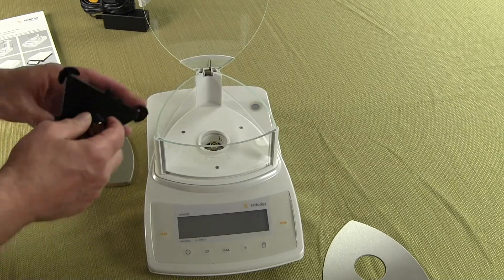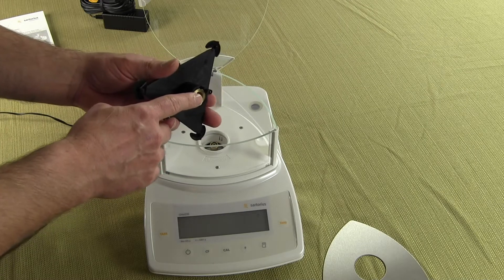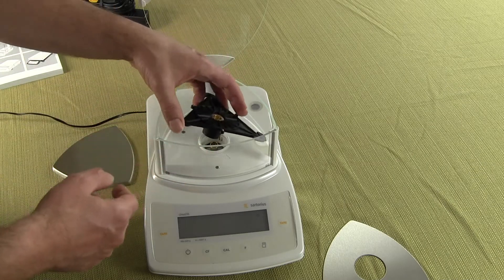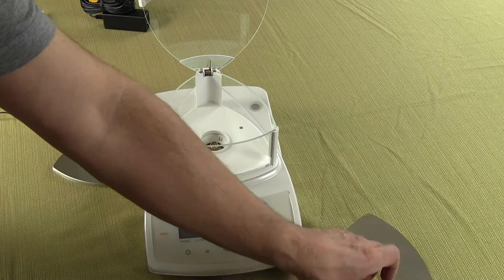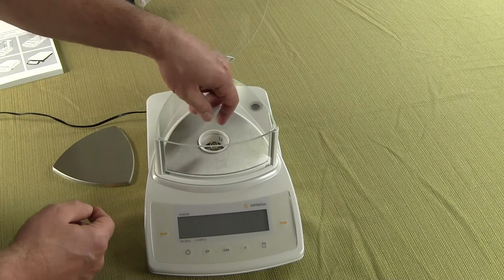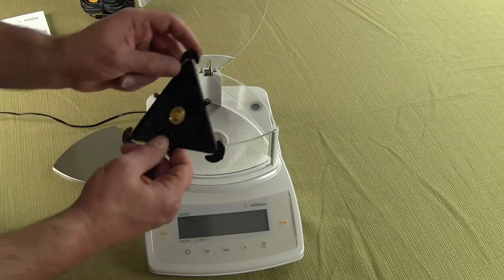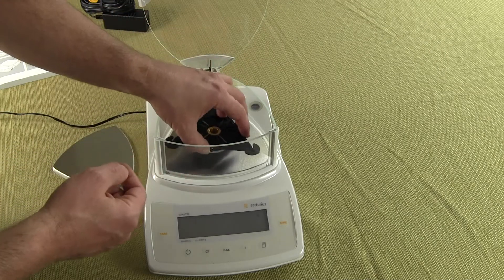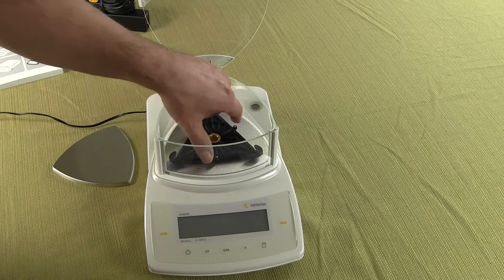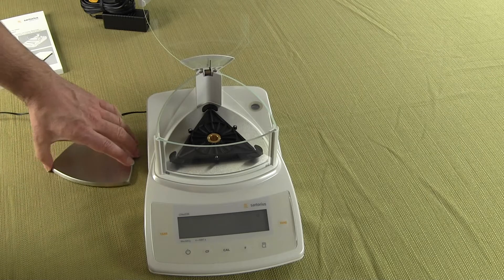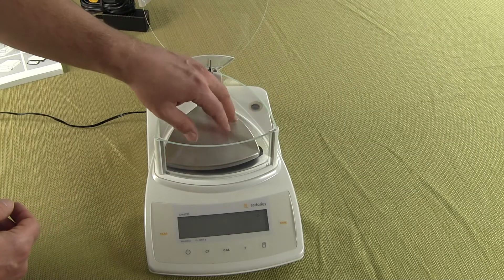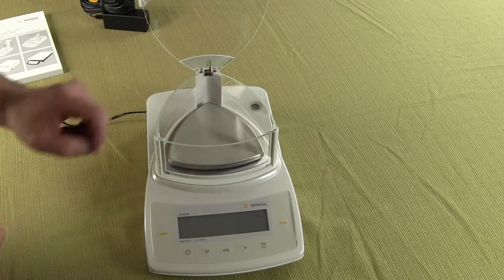The next thing we want to do is put on our pan support. You'll notice the pan support has a groove here. This groove or notch goes towards the rear of the balance. Oops, I'm sorry, before we put that on we want to put on our splash guard. So you want to install your splash guard, this just drops right in on the bottom. Now we want to put on our pan support. And the pan support just goes right on and you can see it's in place. And now we have our stainless steel pan. Stainless steel pan goes on the balance and we're all set.